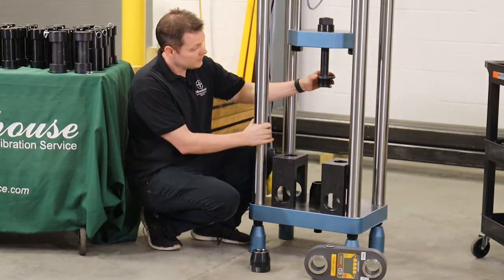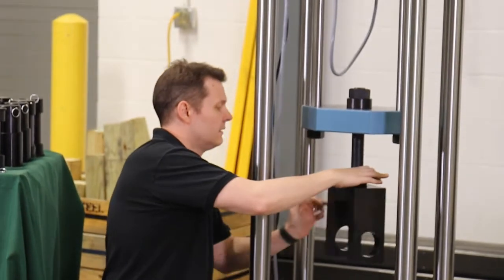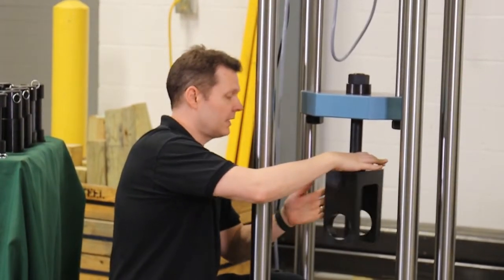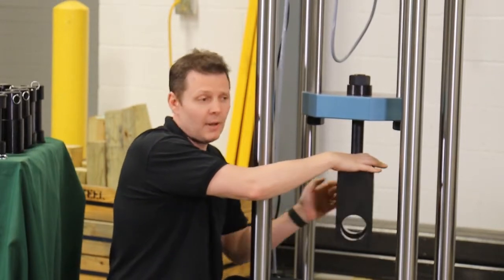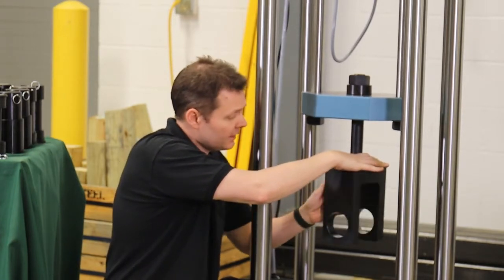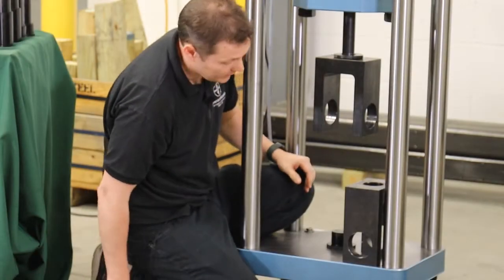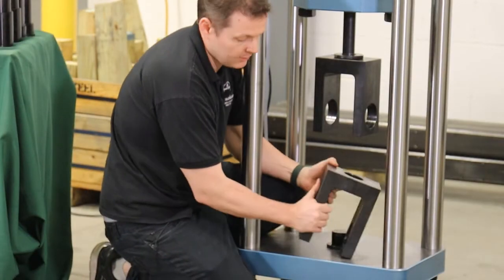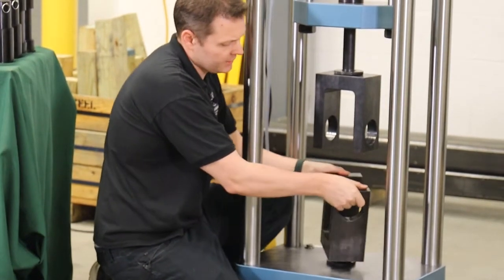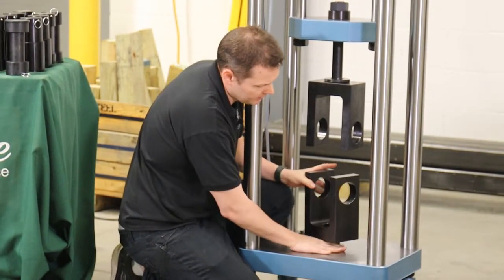The coupling nut comes off — you can see we're on a spherical here, so you just spin it on. The coupling nut comes off and, like mentioned in a previous tension video setup, most people just leave the bottom adapter in. The coupling nut comes off and you thread it in. We do make cases if you want to put everything in a nice case. In our lab, we actually made shelving where we put everything on shelves.